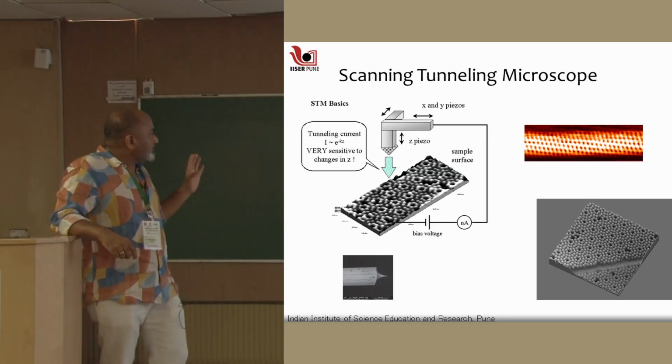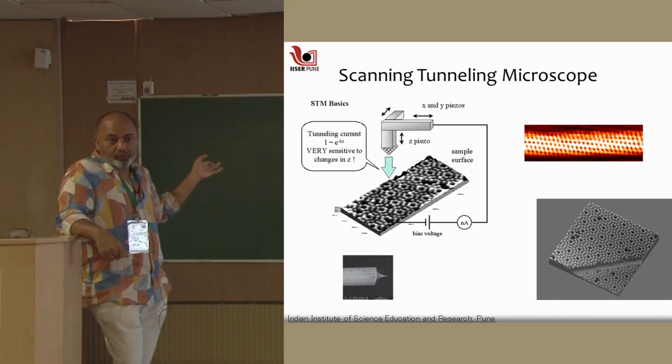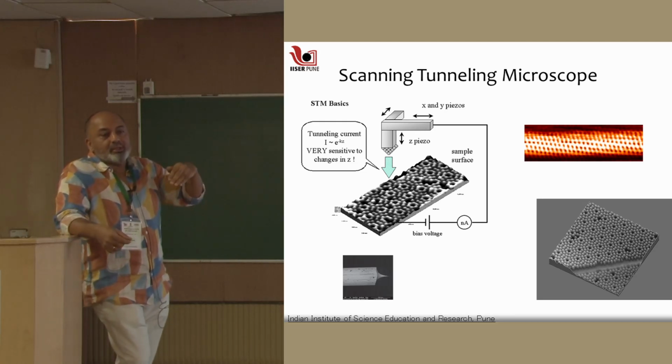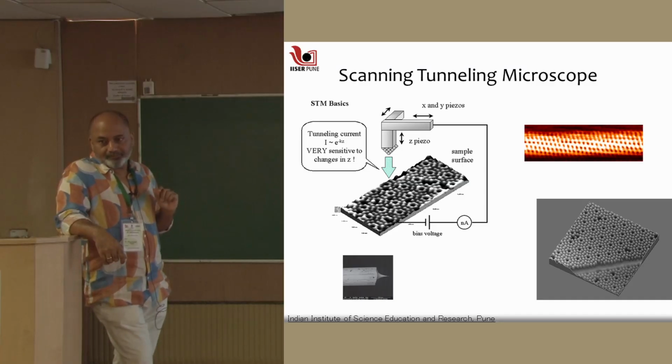So, the ion microscope, okay, the one that we talked about before, it imaged the tip itself and not the specimen, right? There was no specimen actually, only the tip, and the polarized gas atoms which sat on the tip were finally your means of imaging that.